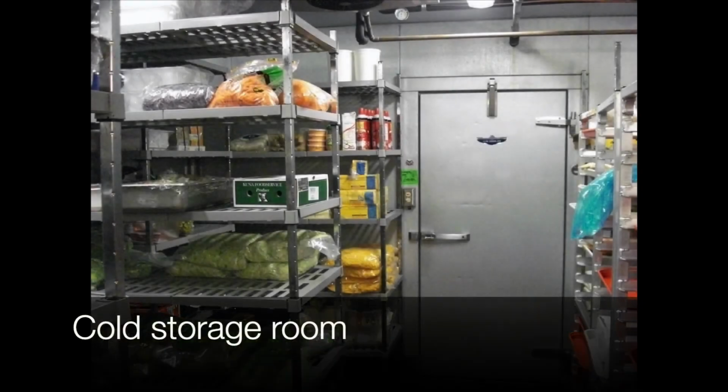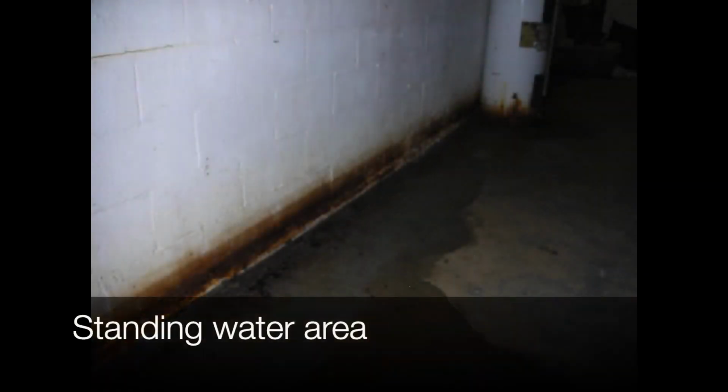Cold storage room. Spend some time in these cold rooms. These are essential to sample when looking for Listeria. Also focus on difficult to clean areas and areas with standing water.